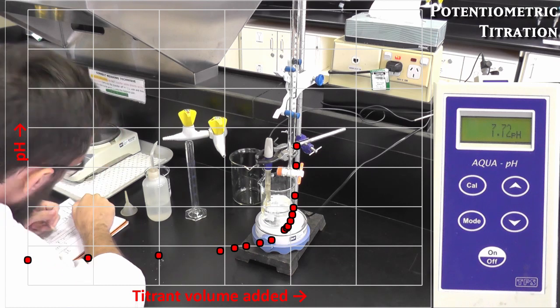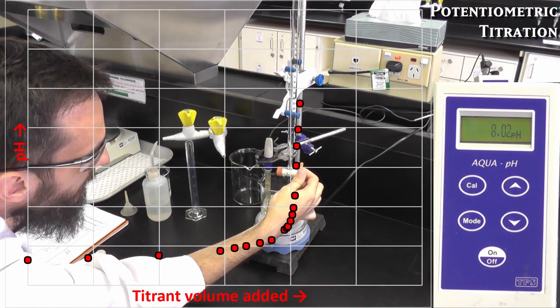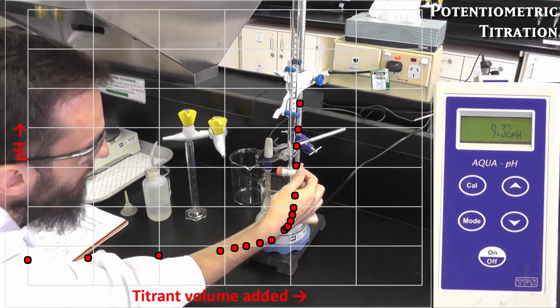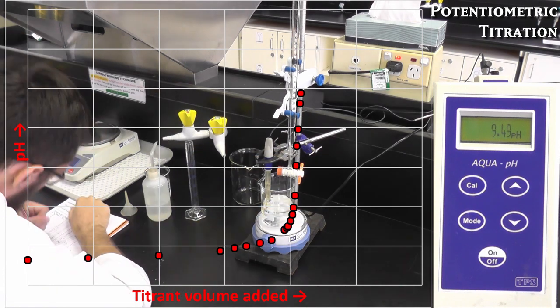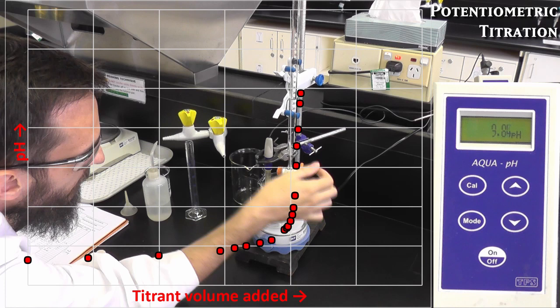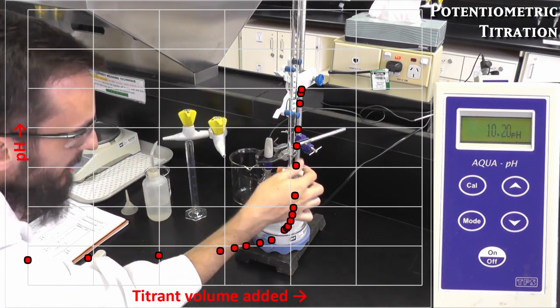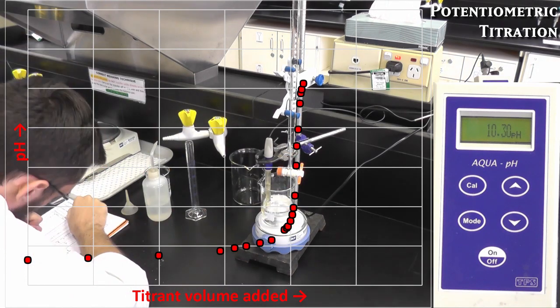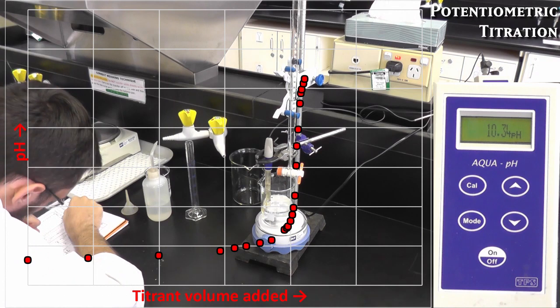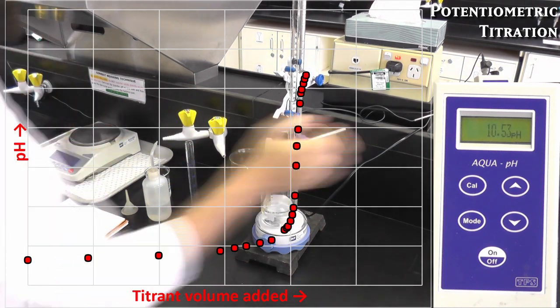Once you reach the upper portions of the pH region, you'll notice the data slope begins to flatten out again as the reaction proceeds towards an excess of base. Once there is a small change in the pH between additions, feel free to increase the size of the addition volumes. When you do your own titrations, you may notice differences in the shape of the plot, such as a lower or higher pH at the start or end, or that much more or less titrant may be required to reach the equivalence point. Try to think critically about why such features might arise.